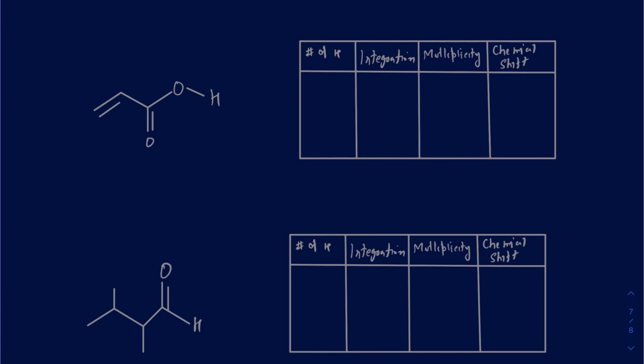I've got double bonds now somewhere along the line. So I've got a proton here, I've got a proton here, and then I've got the 4th proton on the oxygen there. So 1, 2, and even though those 2 protons are on the same carbon, since they are on the double bonded carbons, the environment for these top protons is not the same environment as for these bottom protons. So since that's not the same, they are not going to be equivalent, even though they are on the same carbon. So those are actually going to be your diastereotopic protons.